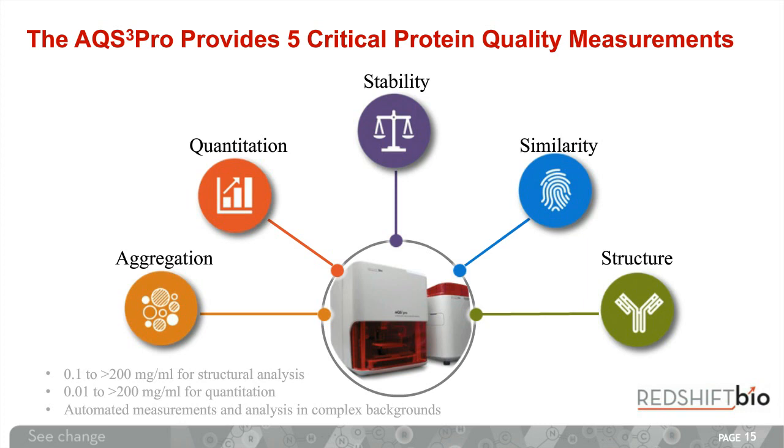And then we can use this in combination with a range of different experiments, for example, a stress test or something like that, in which you might raise the temperature or change the pH of your sample and watch it fall apart or form different types of secondary structures as part of that process. Or we can use the very useful similarity analysis in order to give us some numerical comparisons between different spectra as well. So we have a range of ways of analyzing this data together.